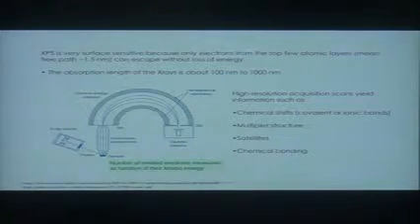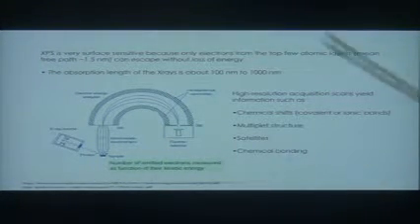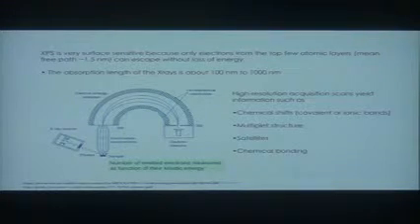What kind of detectors are very sensitive? Well, the detector is not a single entity. What really happens is you have an electron multiplier. They call this a channeltron. I don't know why they call it channeltron, but they have an electron multiplier so that when one electron hits the detector, many electrons come out, and that's what you actually detect. Okay? So this is again a fairly complicated device, but it tells you much about the types of bonds that you have, whether they're covalent or ionic.